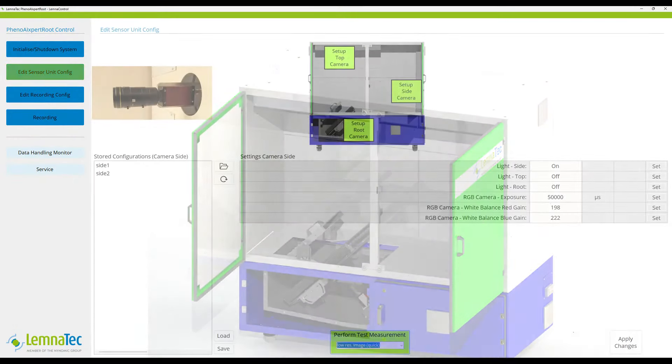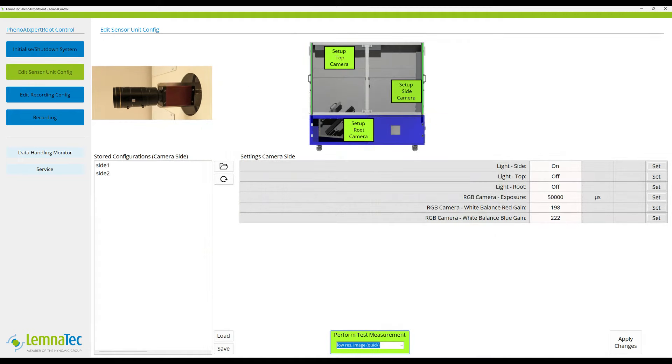Light and camera settings can be done at the computer workstation using the Lemnatec control software. These settings can be stored as recording configurations that can be recalled for sample recording later.